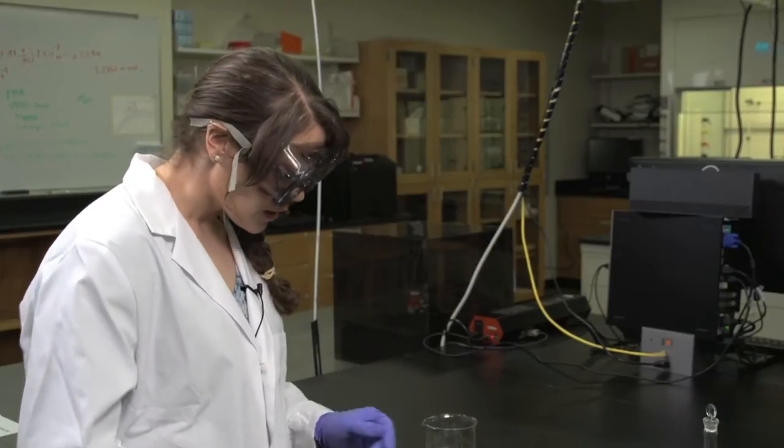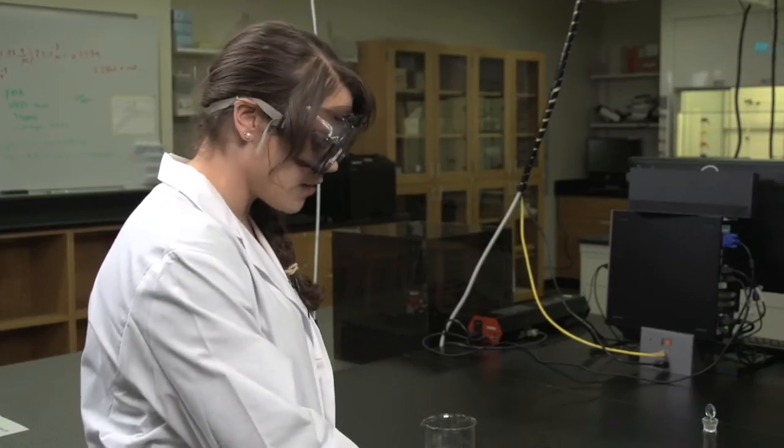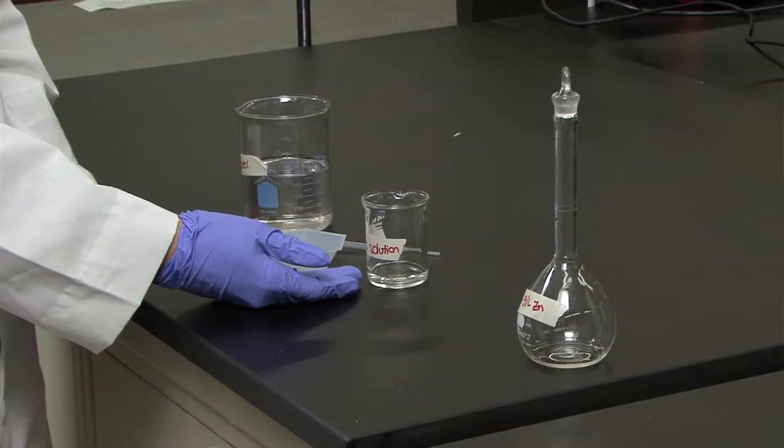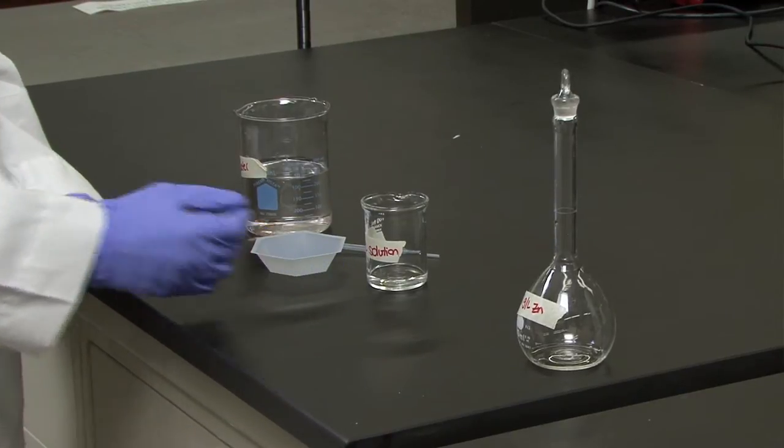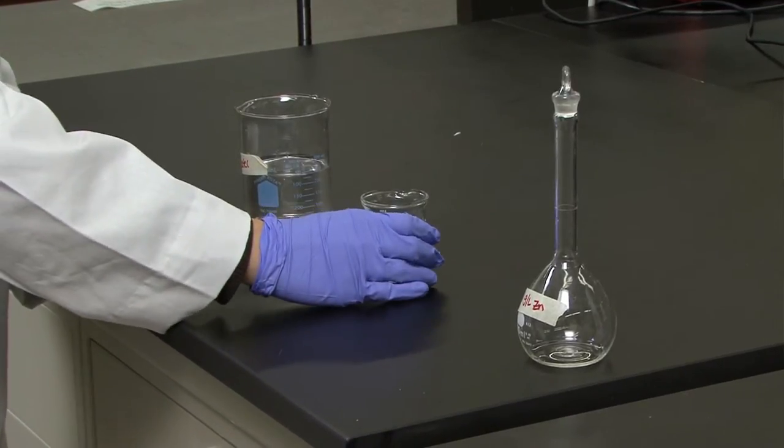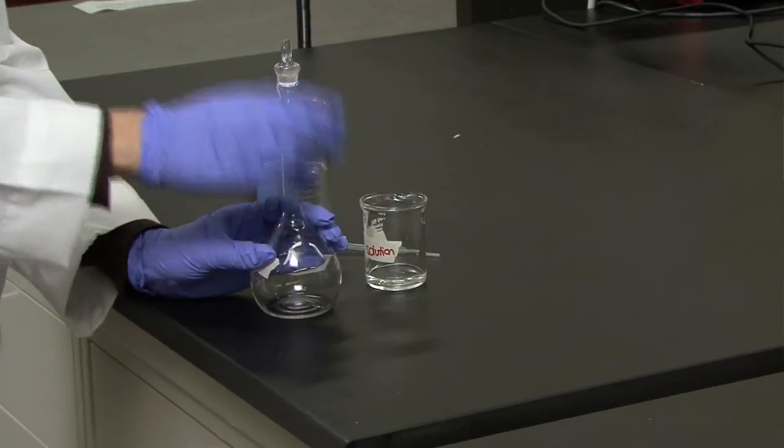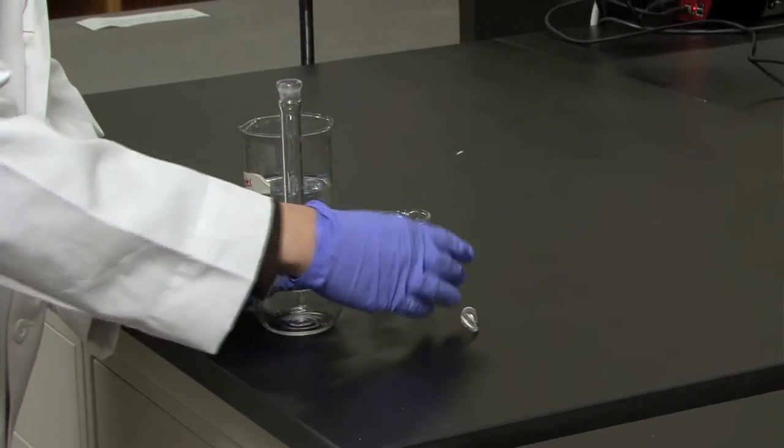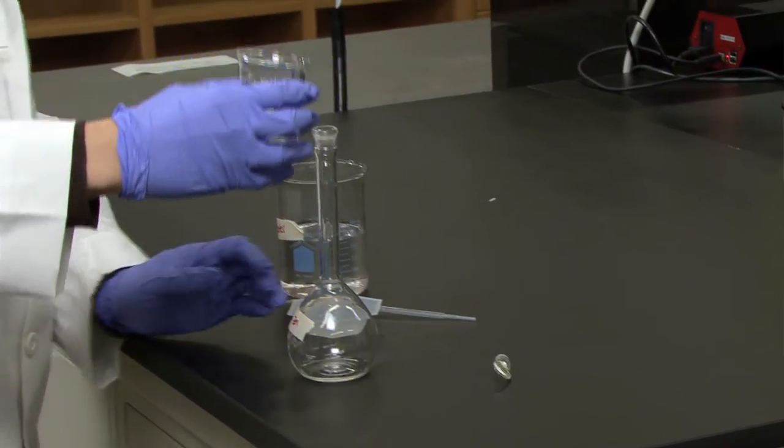Today I'm going to show you how to quantitatively transfer a solution into a volumetric flask. I have already dissolved my zinc metal in weak nitric acid. First, I'm going to pour my dissolved zinc directly into the volumetric flask.